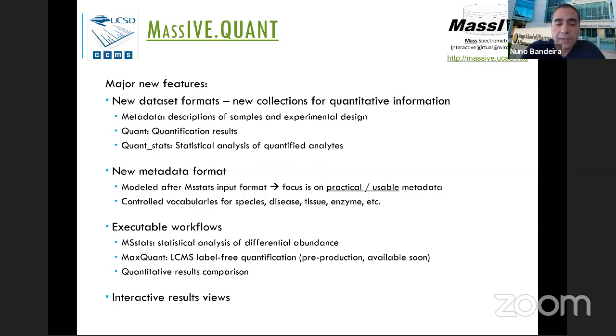One is it is possible to create an MZTab file or an MZID file that has the identified peptide or precursor, to be more accurate, and then links to a scan in a DIA file. So our tool, the mSplit DIA that we use to process DIA data, actually outputs that kind of format. And the current situation is just that most tools for analysis of DIA data do not output anything like that. But even though they could.